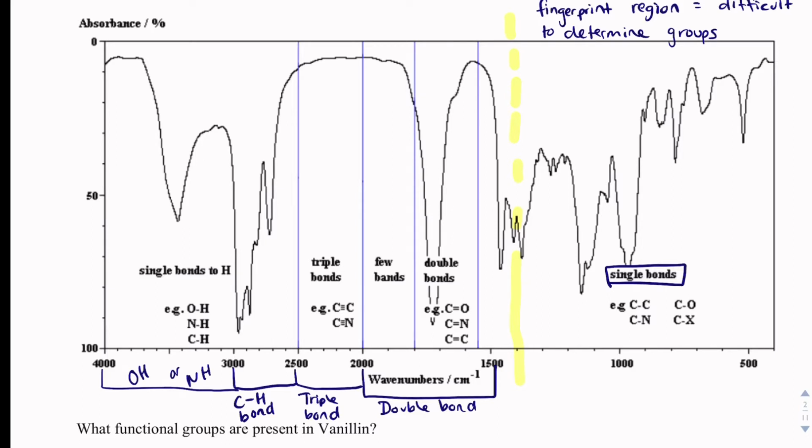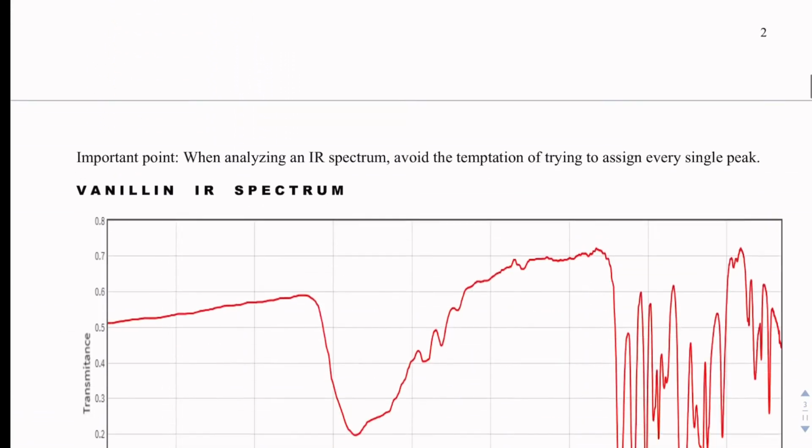Now, stick with me. We're going to draw some things. I think you should have maybe 5 sheets of paper. I know I added 5 sheets of paper here that I'm going to write on. I'm going to draw all the different functional groups on a graph, and that is going to help us get used to how to read these graphs, because when you first see these infrared spectroscopy graphs, it's only normal to say, wow, those look really confusing and difficult.